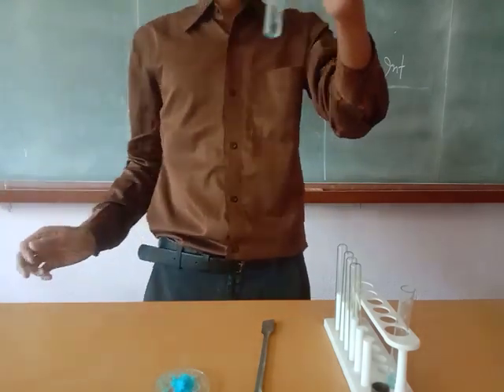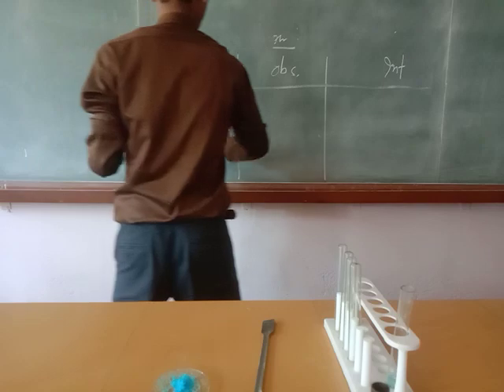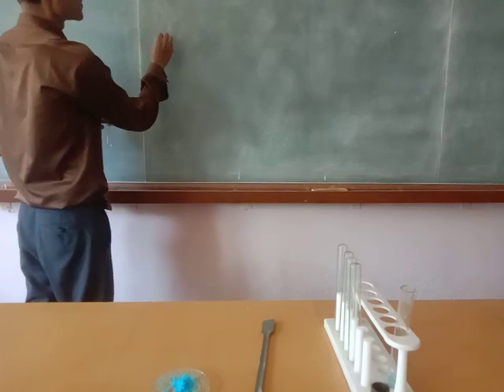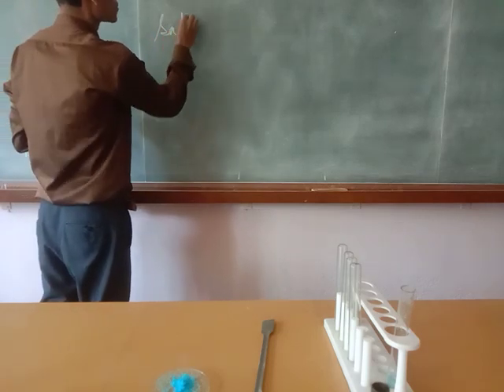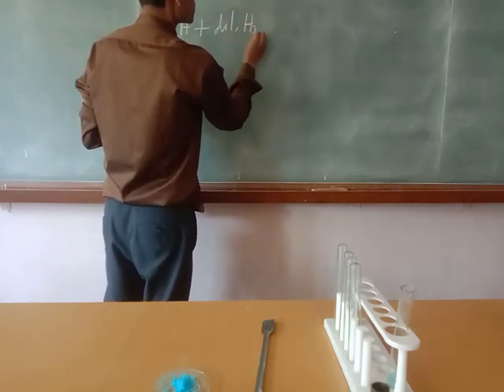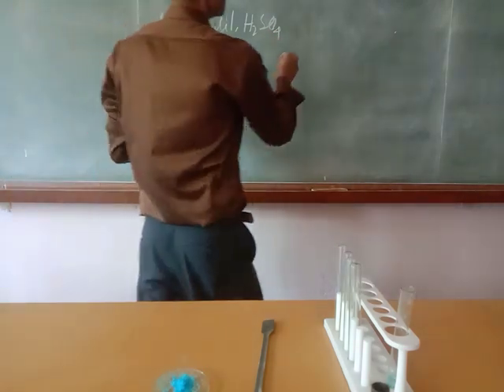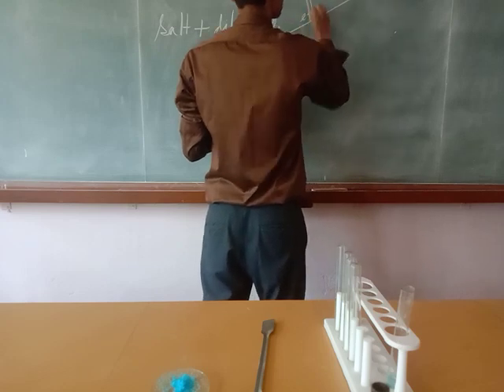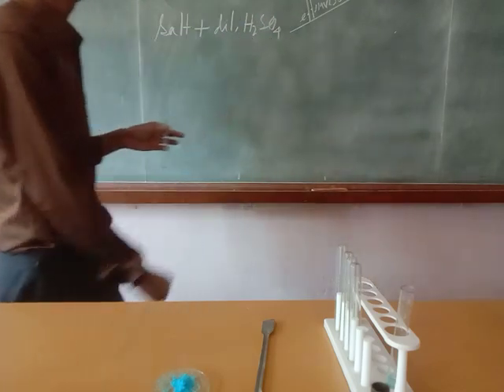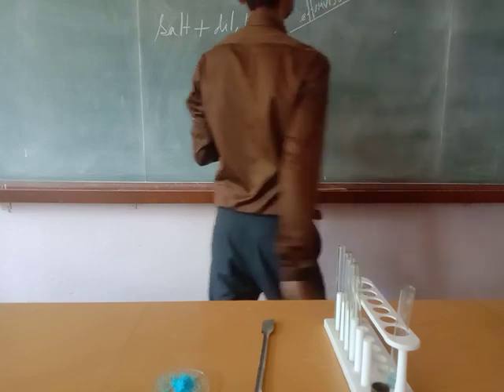So there is no observation. Now see, this is dilute sulfuric acid test. Here I have taken salt, then added dilute H2SO4. After adding dilute sulfuric acid, if you observe effervescence, then it indicates carbonate radical, CO3 2 negative.